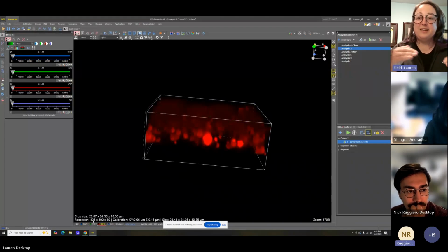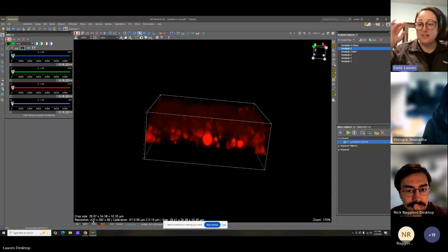So it'll really be up to you whether you want to smush everything together and do an analysis on that, or just pick a certain layer. If you run it on multiple stacks, you do run the risk of getting double counts. That is something to keep in mind when you're doing that kind of analysis.